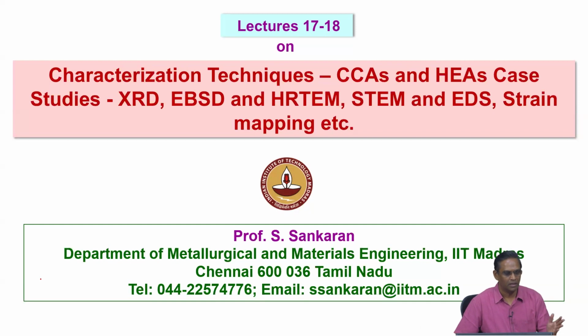But the difficulty comes when you have multi-principal alloys. When they form a microstructure, the lattice is quite strained because of different substitutional alloying elements, right? So when the lattice has significant strain, then identifying the short range order or long range order becomes difficult. Suppose you just think about the atomic scattering factor of all the elements.